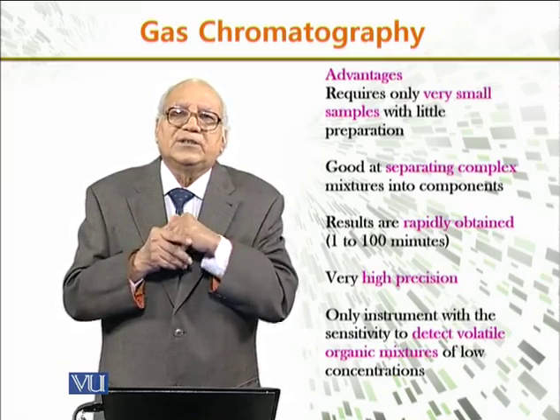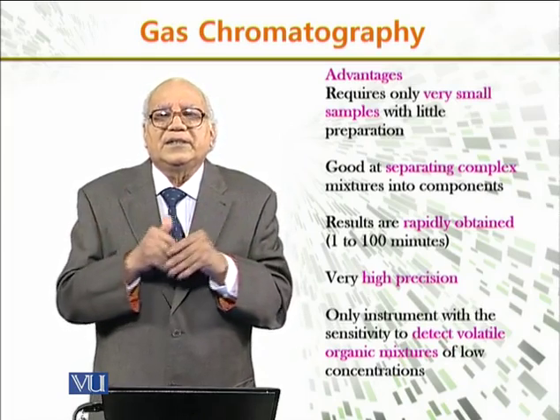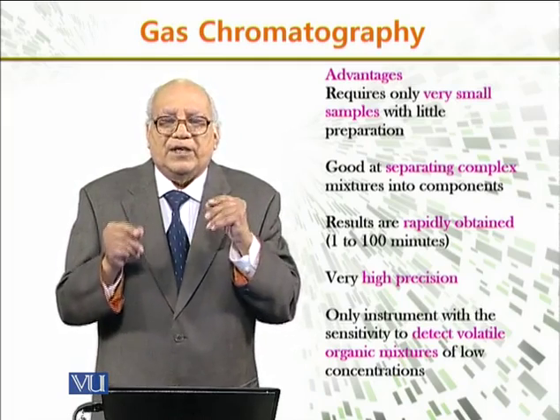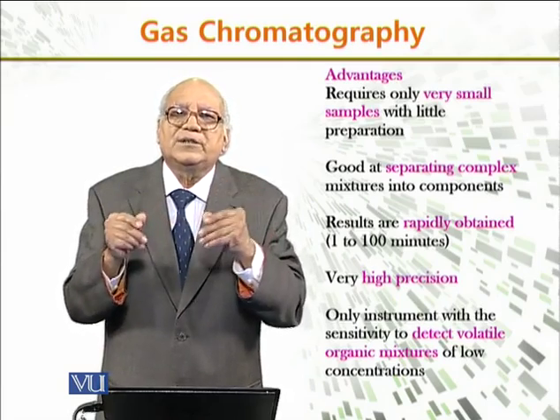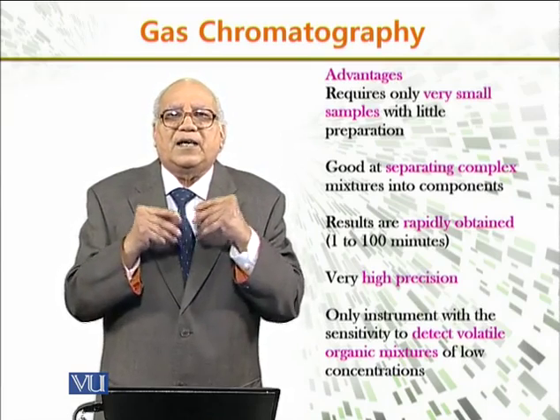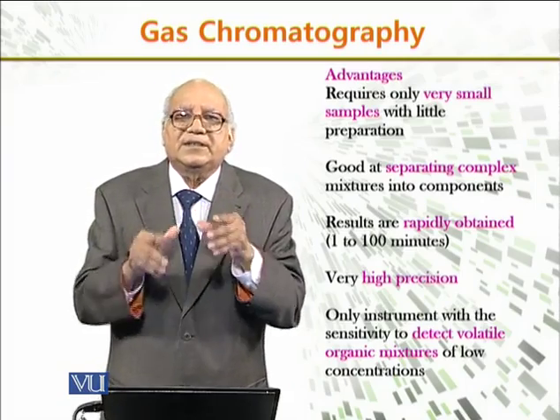We can use the gas chromatography technique for that. And as said earlier, the gas chromatography technique is used conventionally and repeatedly in molecular biology due to its properties and characteristics as indicated earlier in this lecture.